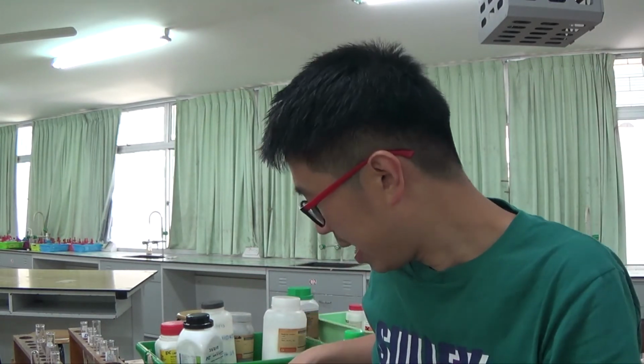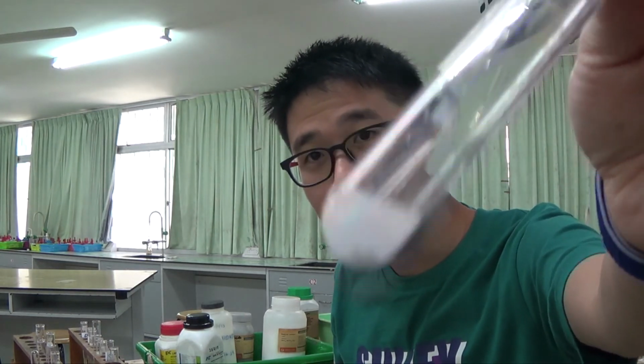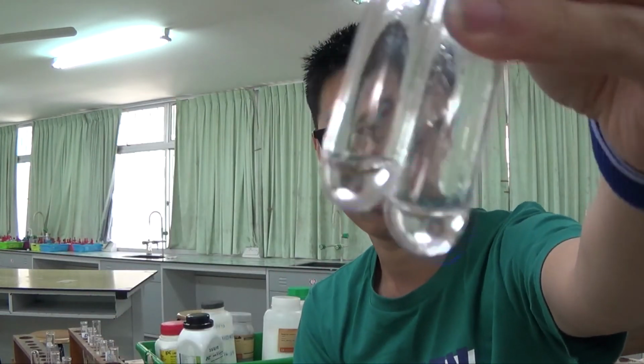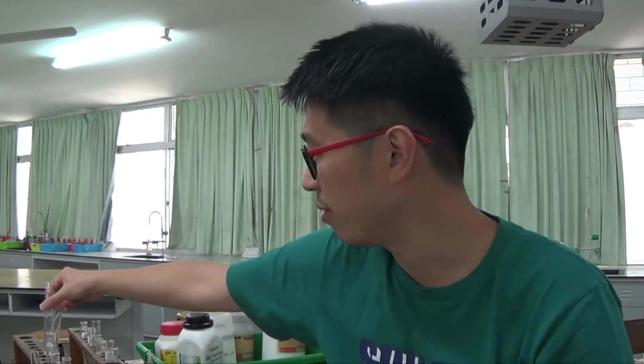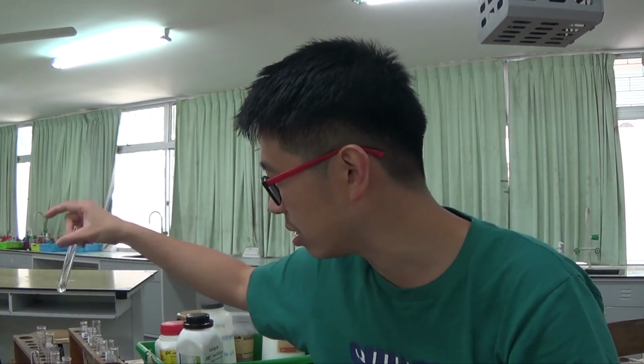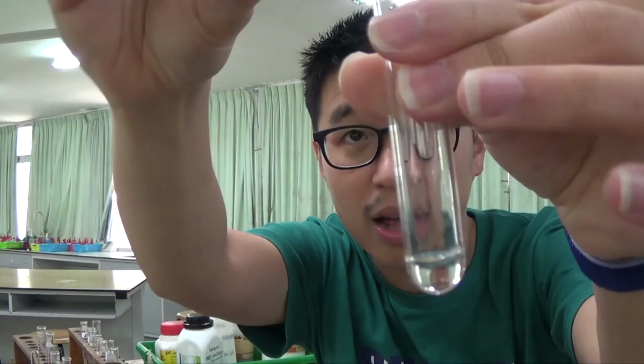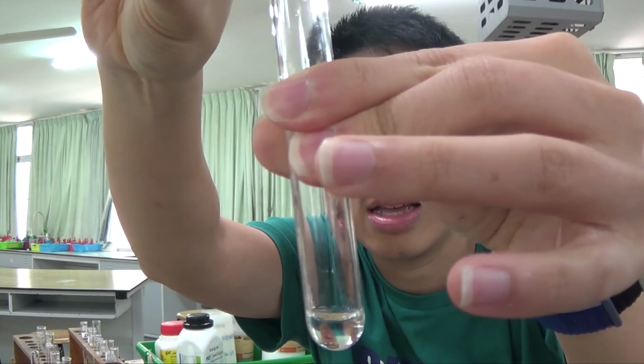Anyway, I'm not going to test for the chloride here. I'm more interested in the test for the cations. So I have my two solutions, which, to be honest, look really colorless because of the low concentration, even though it looked like a pink solid just now. I said my ammonia is running low, so I'll add a little bit, and then I'll add in excess.